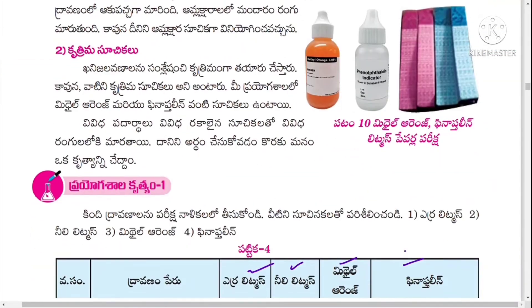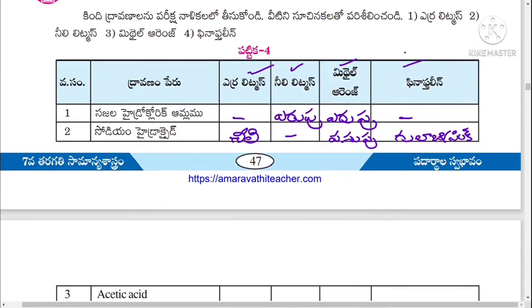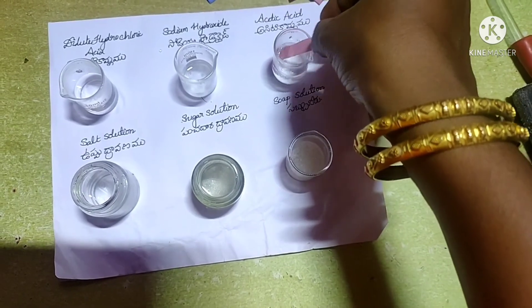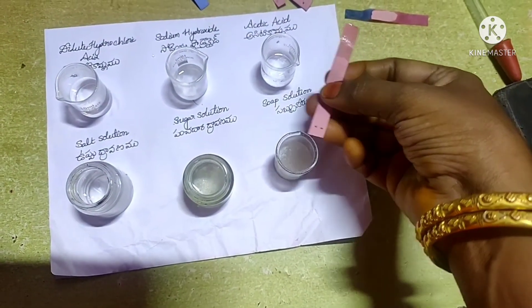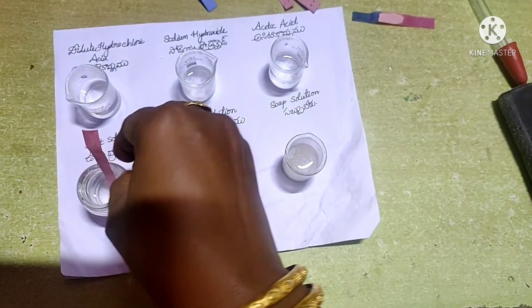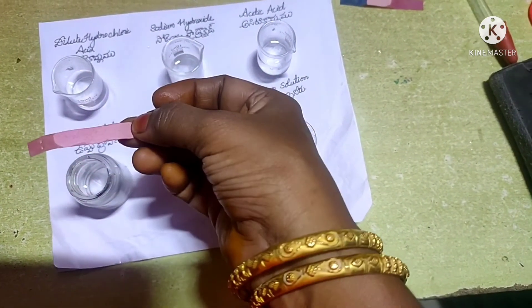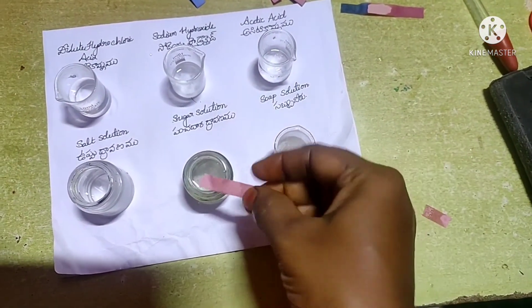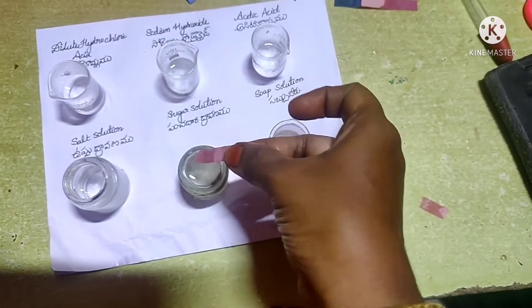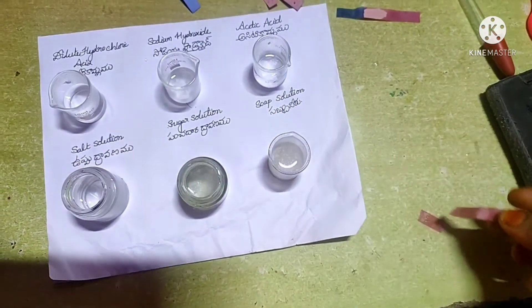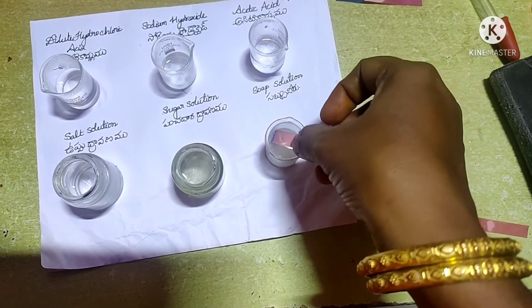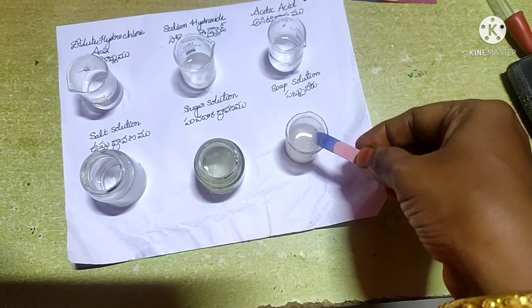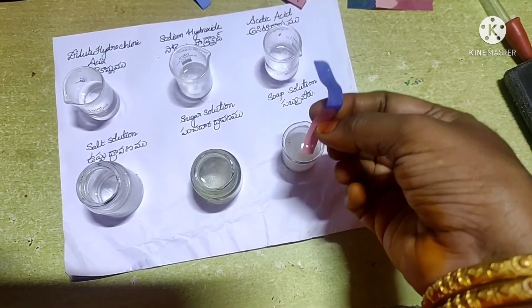Take red litmus paper and insert it in acetic acid solution and observe the color — there is no change. Dip red litmus paper into the salt solution — there is no change. Dip into the sugar solution — there is no change. With the soap solution, it will turn blue. So whenever the red litmus turns blue, that solution indicates a base solution.